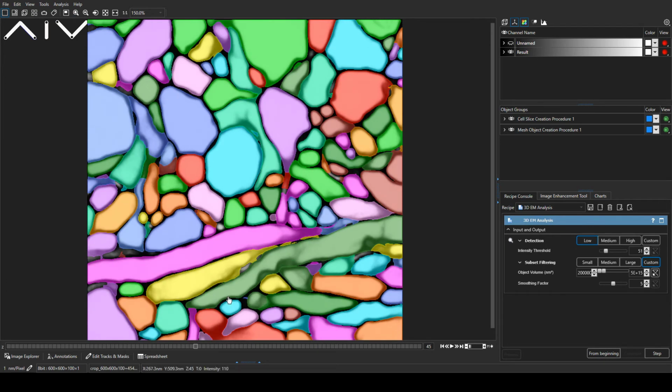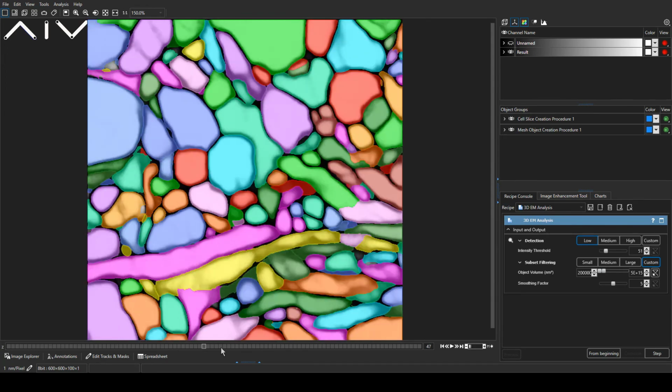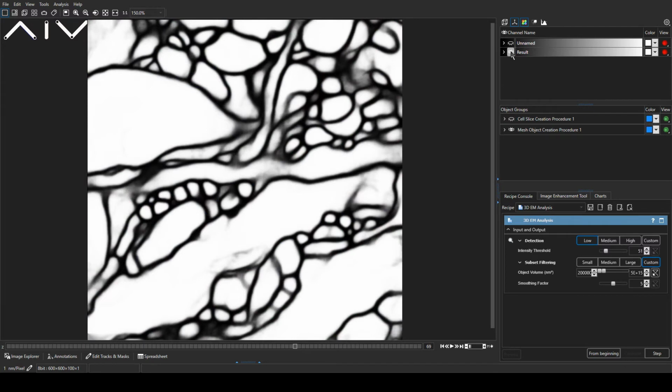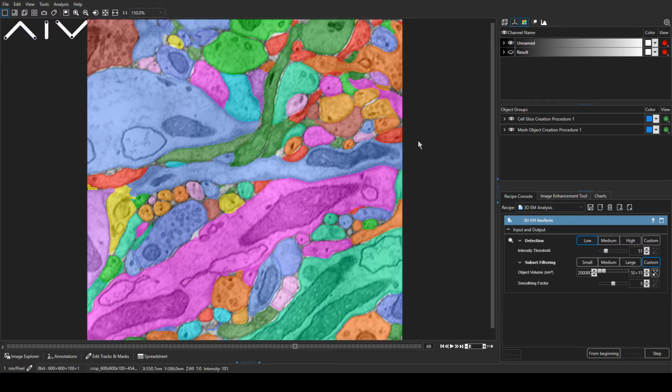When I say small, I mean maybe 4 or 5 regions of interest, each one of them 30 slices, 500 by 500 pixels, with ground truth. That's a relatively small amount of training data that we can use to augment the model that we have already implemented, and that works reasonably well out of the box.